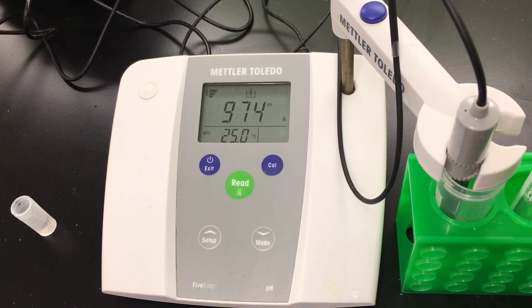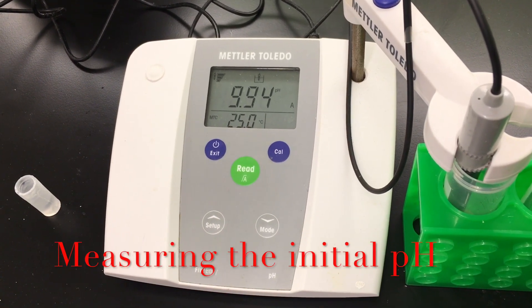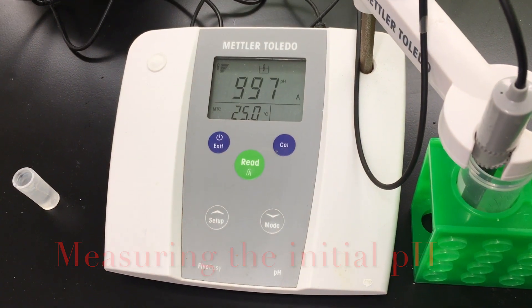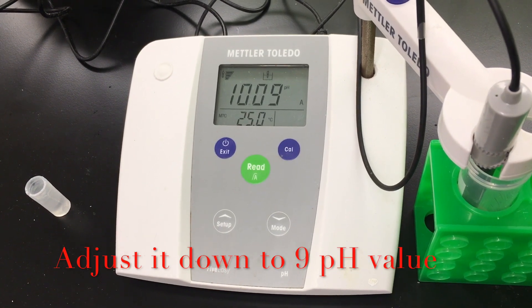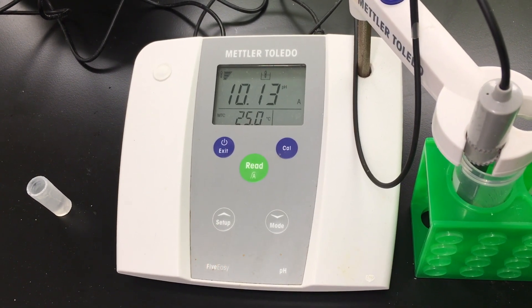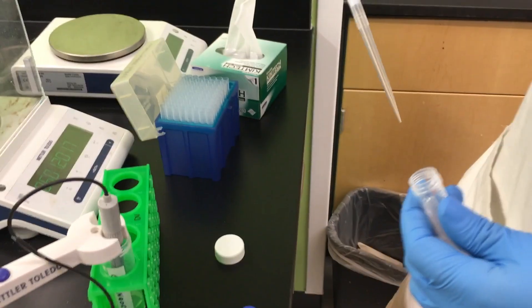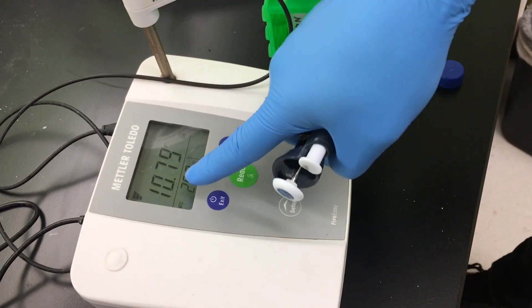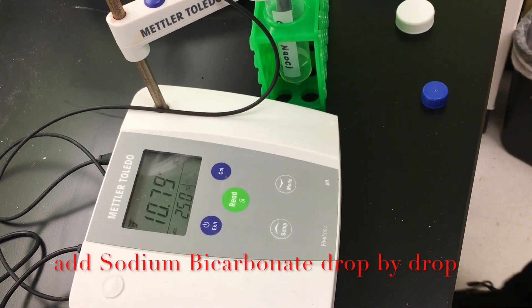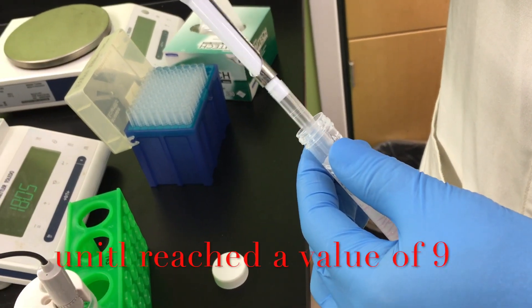We are now measuring the pH of the 0.5% sodium hypochlorite solution that we prepared, and we want to adjust it down to pH 9. We are going to adjust the pH using sodium bicarbonate. The unpowered — unbuffered — sodium hypochlorite has a pH of almost 10.8, so we can use sodium bicarbonate to adjust and drop that pH down to 9.